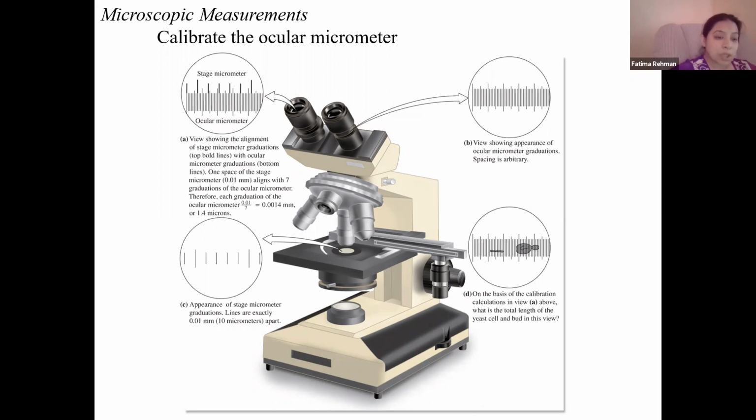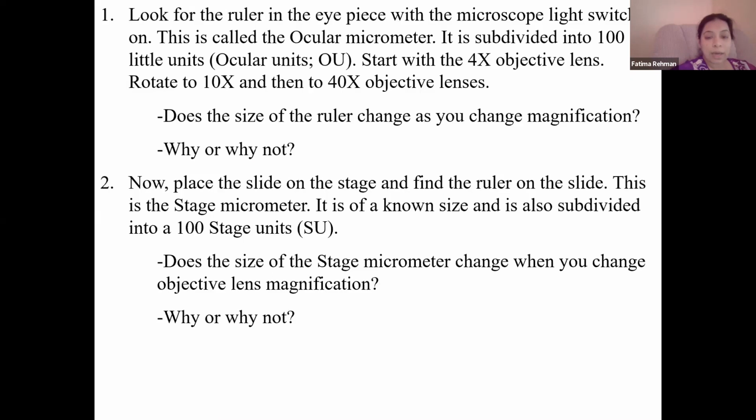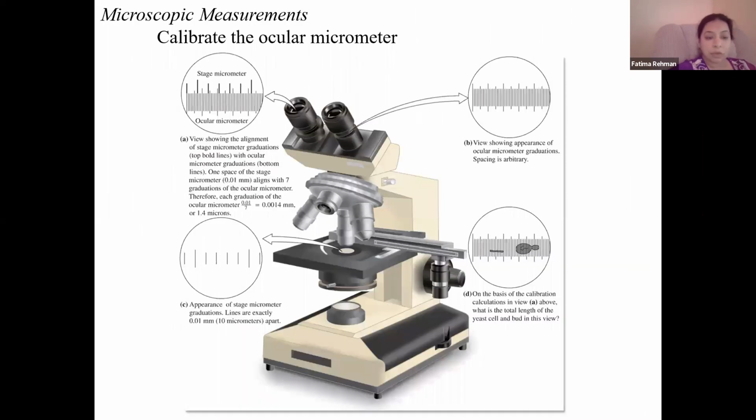But it's especially important to do that when you're looking at images or actual cells that are translucent, that are not stained. Now, obviously, we can adjust the light with the actual light intensity over here. So you can adjust the brightness from the light source. But there's another way that you can adjust it. What is that?